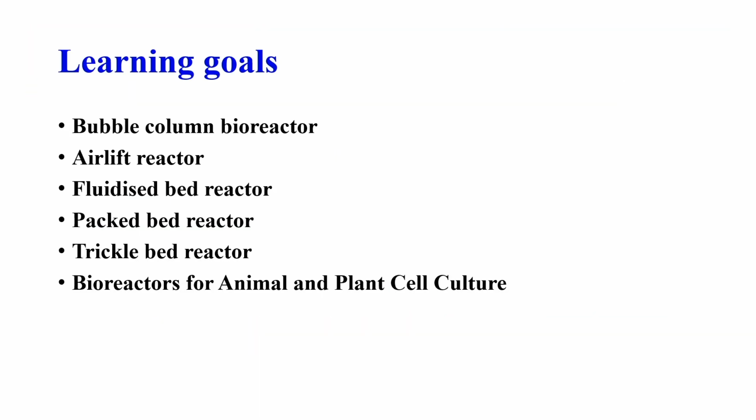Now, today we are going to discuss some special bioreactors, particularly bubble column, airlift, fluidized bed, packed bed and trickle bed reactors. In addition, we will see the summary of bioreactors required for animal and plant cell culture.